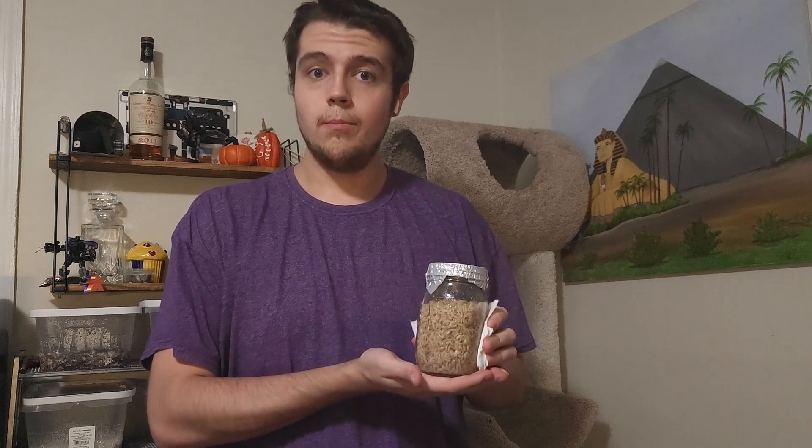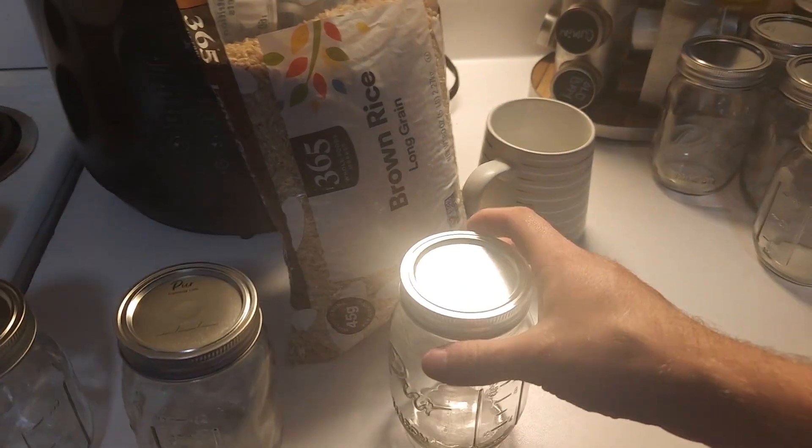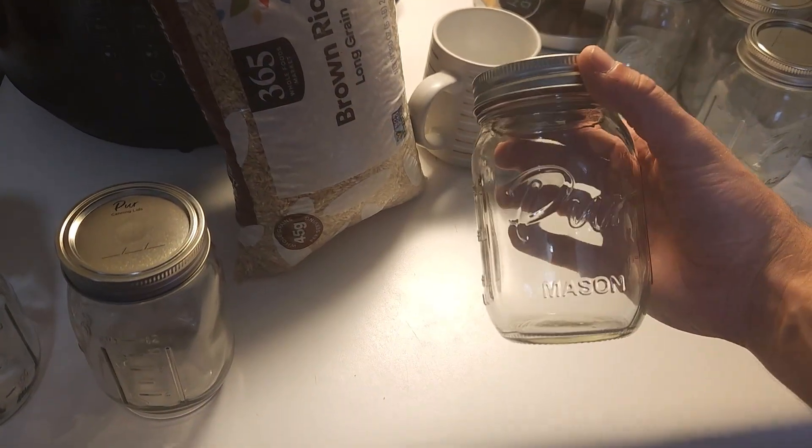Hi guys, welcome to the Fungi Files. Today we're going to be preparing some brown rice and grain spawn, some liquid culture, and inoculating some agar dishes with cordyceps for future projects, in preparation for some more completed cultures.